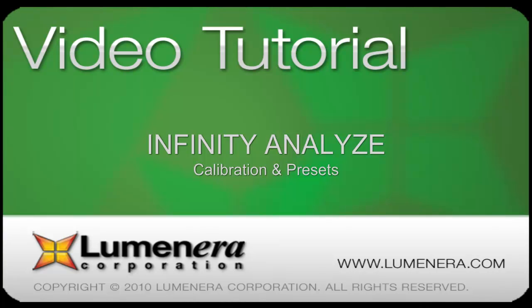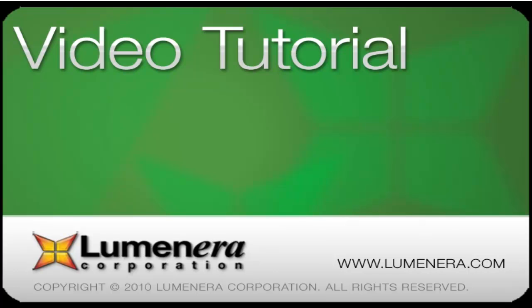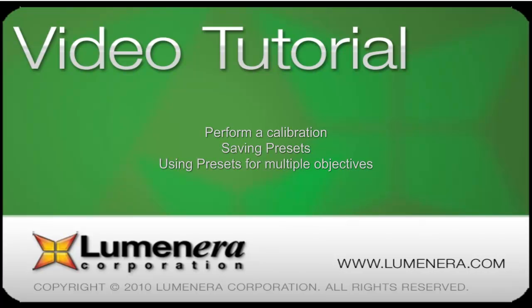This is part of the series of tutorials that provide an overview of the Infinity ANALYZE capabilities and features. In this lesson, we'll be taking a look at calibration and presets. Many applications require that accurate measurements are taken on microscope samples. This requires that a reference be retained between the objective and the application software in use.